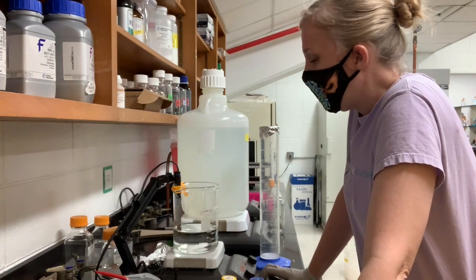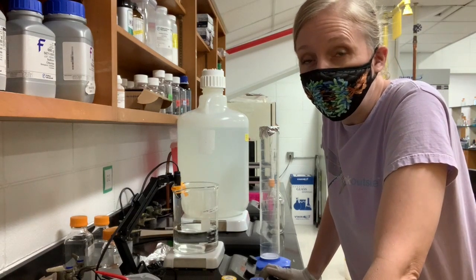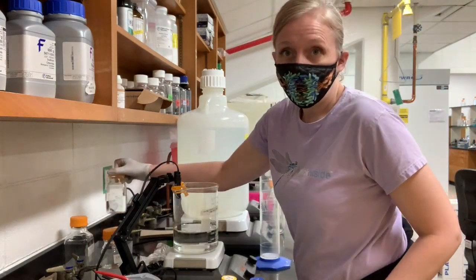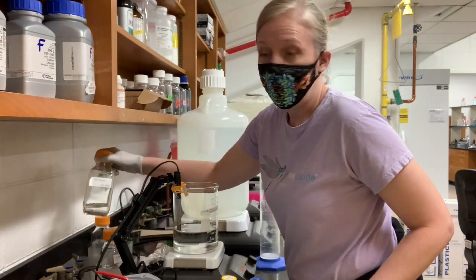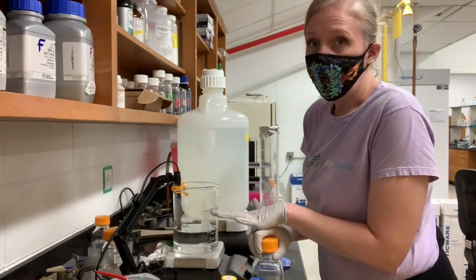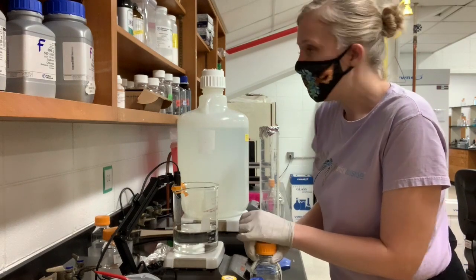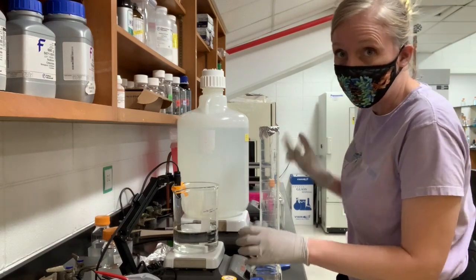Because this is 6.68 and I need to pH this solution to 7.4, I need to add a base. And we have some solutions back here, including 5 normal HCl if you need an acid, 5 normal NaOH if you need a base. Those will be the ones that you'll use. These are strong acids and strong bases, so you want to practice really good chemical safety when you're using them. Be aware of where the eye wash station and the shower are, just in case you get this on you.